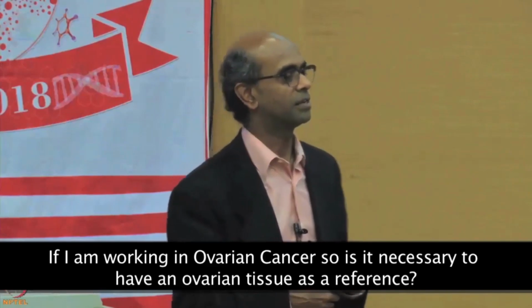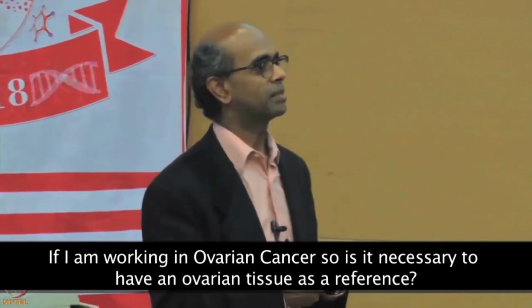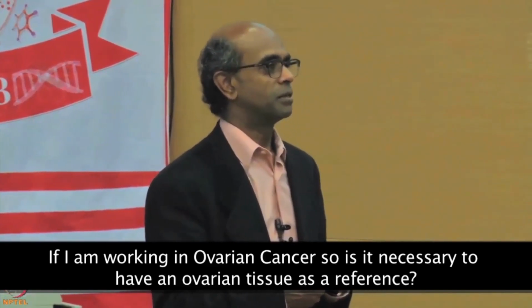If you are looking at ovarian cancer, the reference sample, does it have to be an ovarian tissue? Preferably, because there could be proteins that are specific to ovarian cancer that may not occur in other types of cancers or other normal tissue that you could include, and if you don't have it in the reference, you're more likely to miss it. So, if we don't have a normal control, can we pool the mixture of the tumors and use it as an internal control?